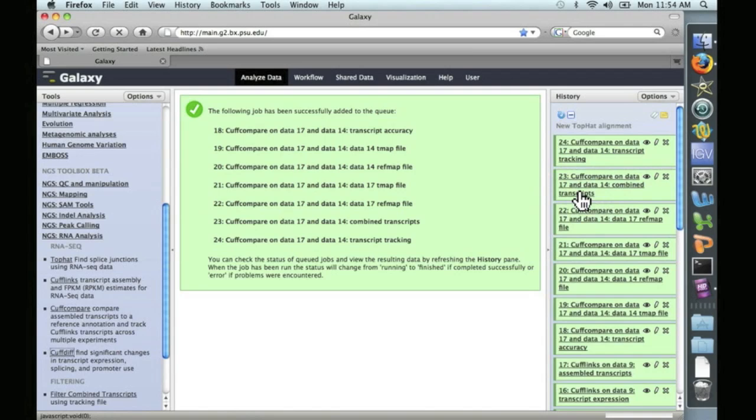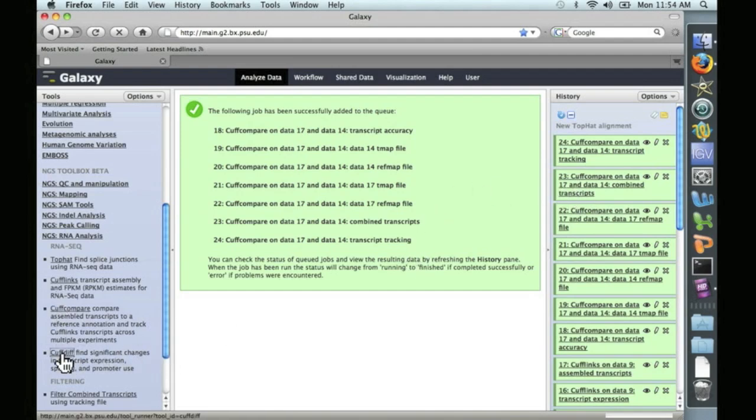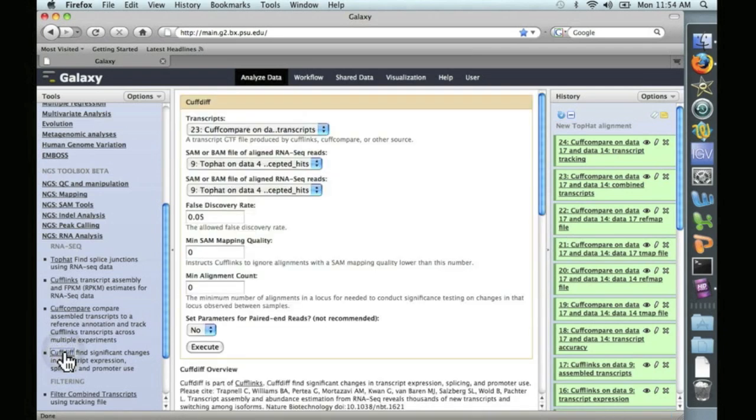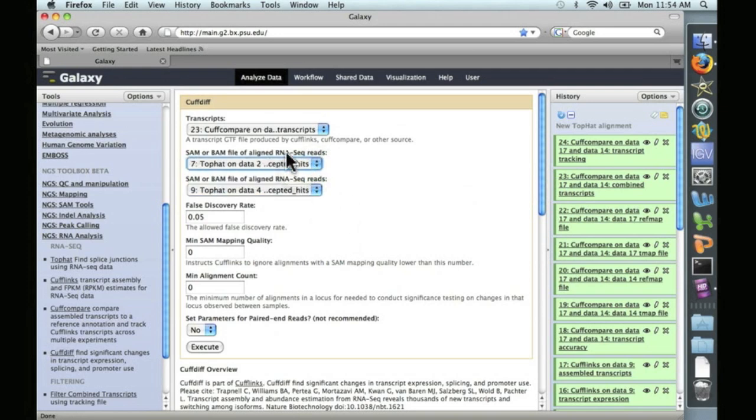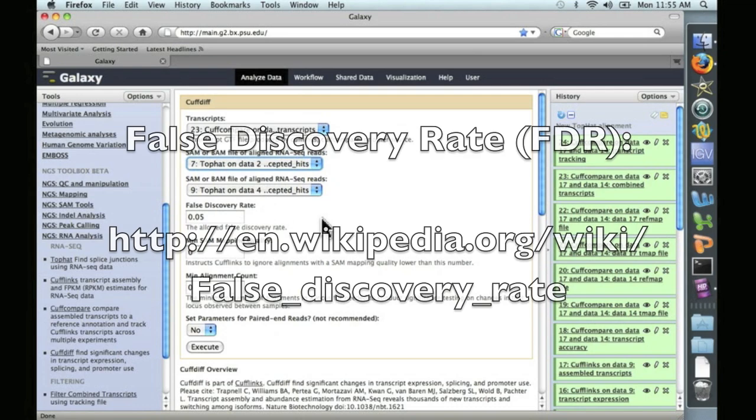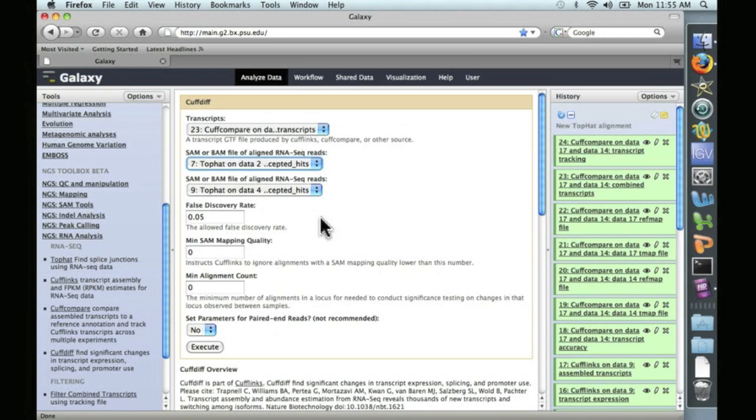And so, CuffDiff is going to use the output of this comparison, as well as the original SAM or BAM files, to do a statistical analysis and look for significant differences in transcript expression. CuffDiff is the last option here under RNA-seq analysis. Let's go ahead and click on that. And it automatically finds this file number 23, the combined transcript data. And we need to change one of these two. So now we have the first dataset here from the TopHat alignment and the second dataset here. CuffDiff will use the false discovery rate method. You can read about that at the following URL, but we'll leave it at 0.05 and we'll run the analysis.